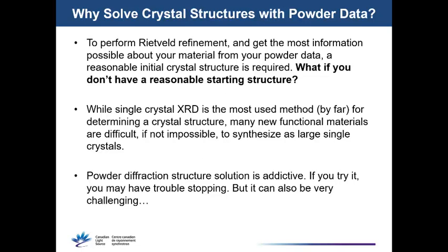Right. So solving structures with powder diffraction data, it's challenging, but it's actually quite rewarding, especially if you like doing puzzles. It's a really interesting undertaking, and it's kind of addictive. So if you try it, you may not be able to stop. Brian Toby's line about this is that when trying to solve a crystal structure from powder diffraction data, the structure actually has a chance of not being solved. So it's much more of a sport than single crystallography, which is just trying to find the atoms.